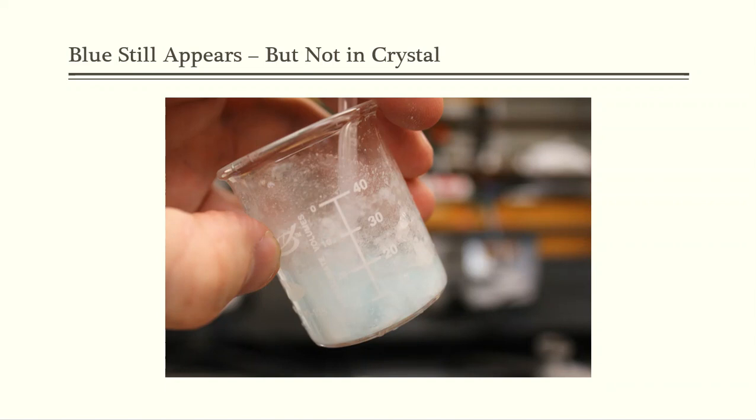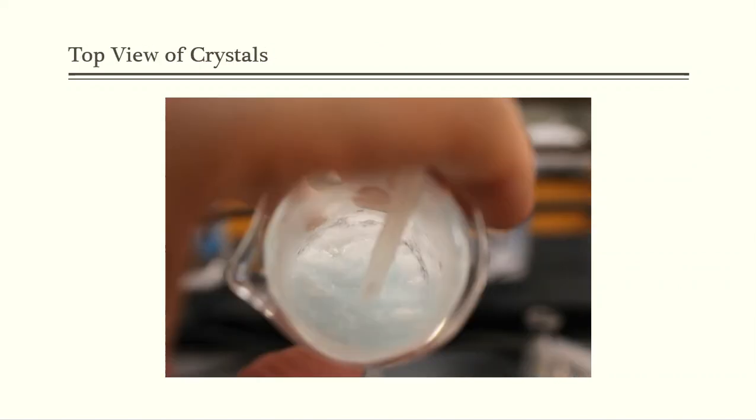So I put my basically plastic pipette into the beaker. I swirled it around a little bit just to stir it up, to get it agitated, and that allowed me to see those crystals even more so, as you can tell on the side of the beaker and probably here on the side of my finger.